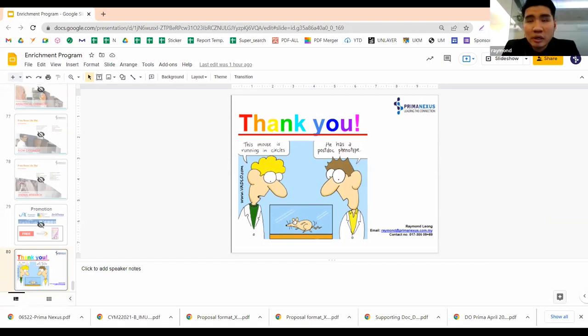Oh, okay. So I saw most of the groups are using SD Sprague Dawley rats for diabetes work. I see occasionally, not much, ICR mice being used. If you are talking about induced diabetes, I presume that you are going to use streptozotocin to do the induction. So you're going to inject streptozotocin in, and then the streptozotocin is going to affect the pancreatic cells and create an environment for diabetes. That event is going to create some shock to the animals, and bigger animals tend to actually survive better. I see most of the groups using SD with a good success rate, I would say. I mean, this is from my experience in the field.